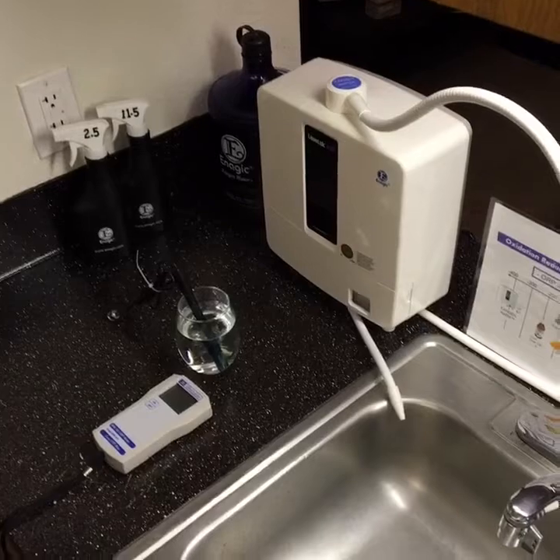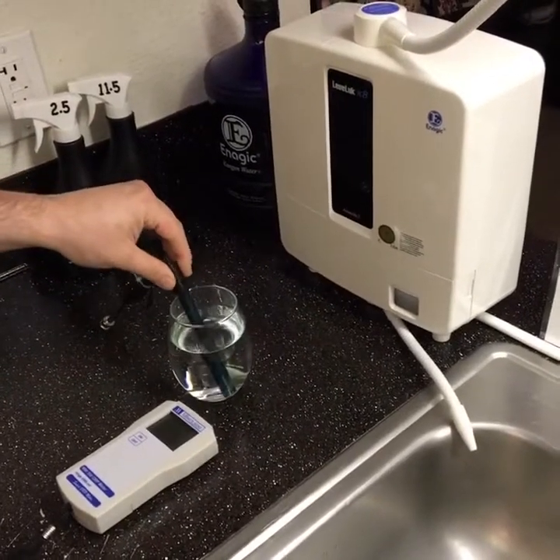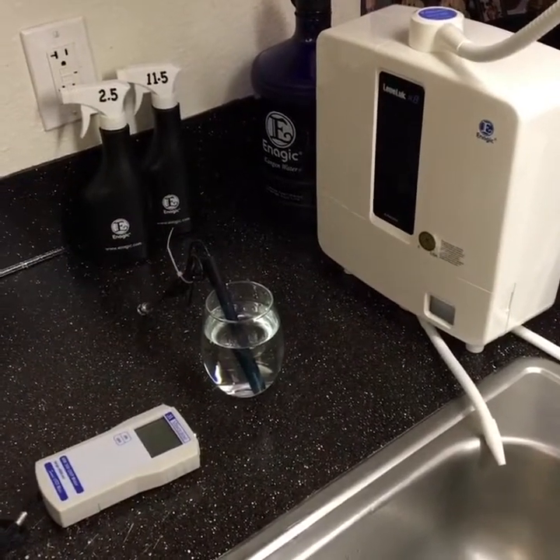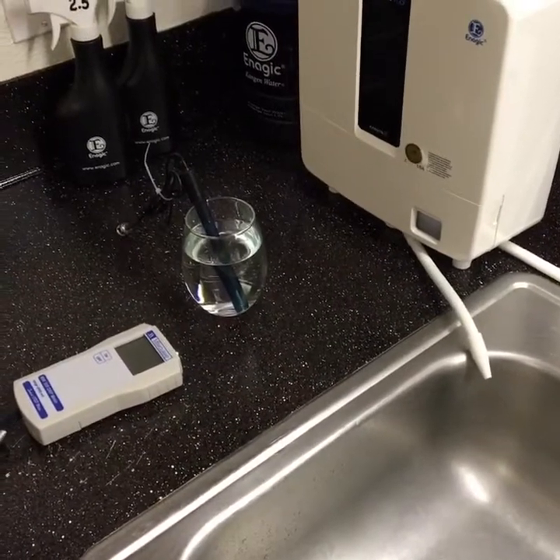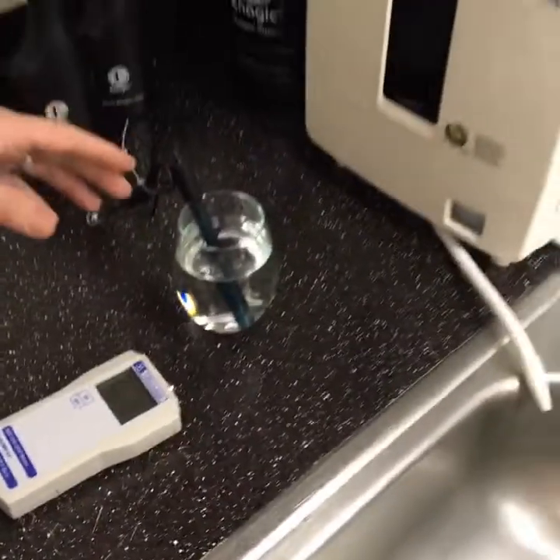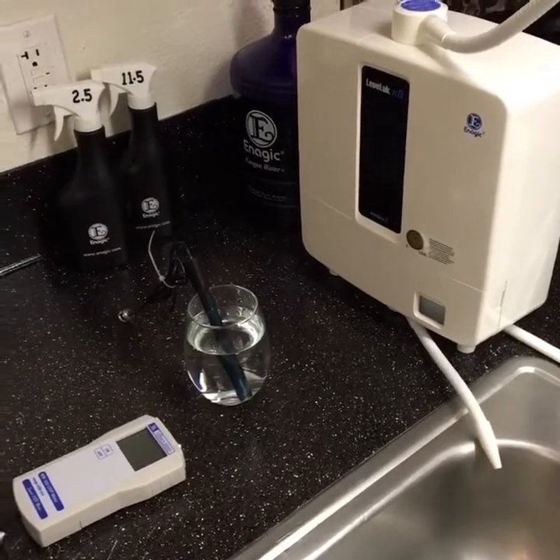When you do an ORP presentation and test the waters, you just take it out of the cap and maybe soak it in a little bit of the 2.5 strong acidic water. You always want to keep the platinum tip acidic — that ensures the effectiveness of the ORP meter. After the probe has been sitting for 48 hours, you're ready to do your presentations and demonstrations showing people the negative antioxidant-rich Kangen water and how positive all the conventional waters are.